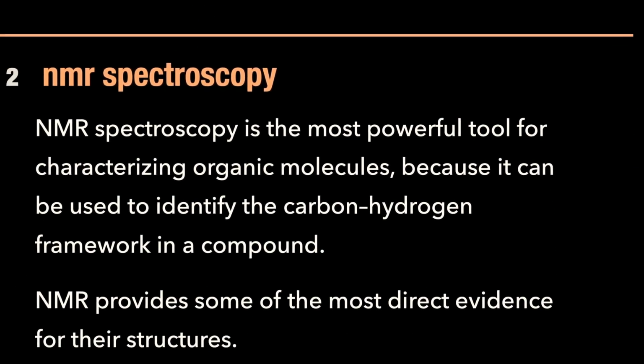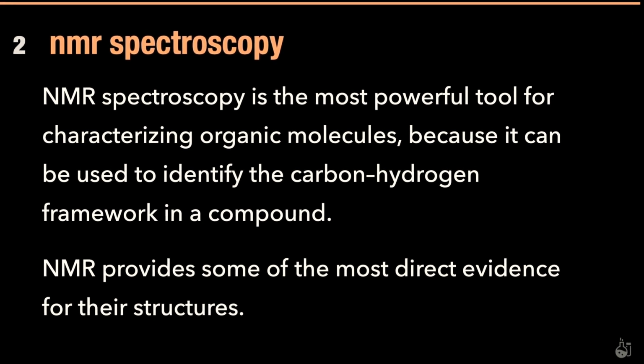So what is NMR spectroscopy? You've already done two forms of spectroscopy in spectrometry: mass spectrometry and IR spectroscopy. IR spectroscopy told you what about compounds? IR was specifically about the functional groups. NMR is beautiful because of its power. That tool is extremely powerful.